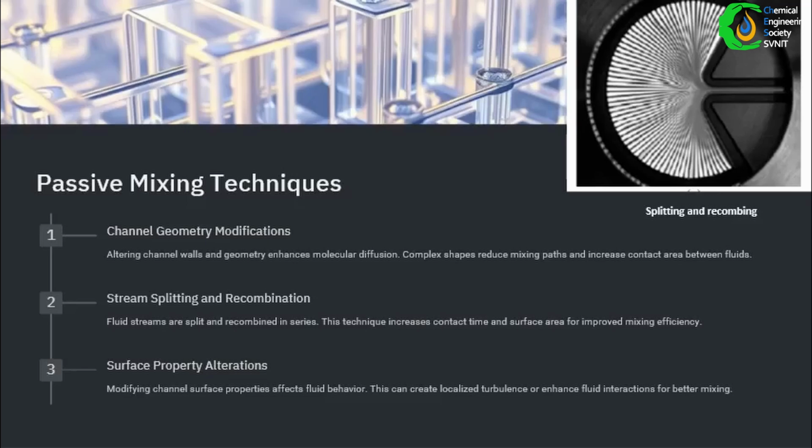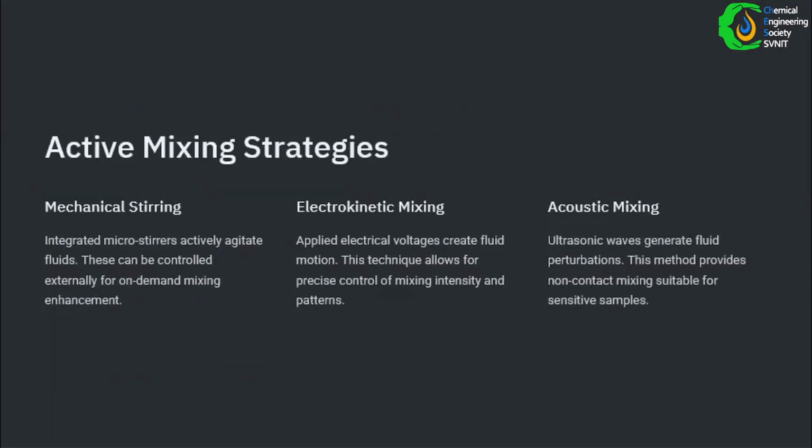In contrast to passive mixing enhancement, active mixing enhancement offers more flexibility in the degree of mixing achieved. However, due to tiny moving elements, such precise control demands much more elaborate and expensive production. The most widely used is electroosmosis. It employs electrodes inserted in a specific channel to create an electrostatic field that drives the neutral liquid contained in it in the direction of the electric field, increasing the velocity profile and thus aiding in mixing.